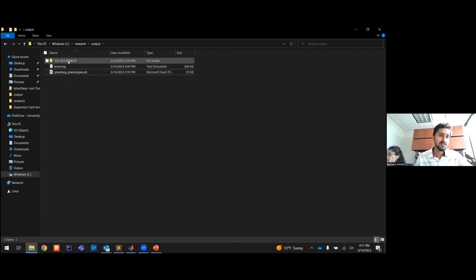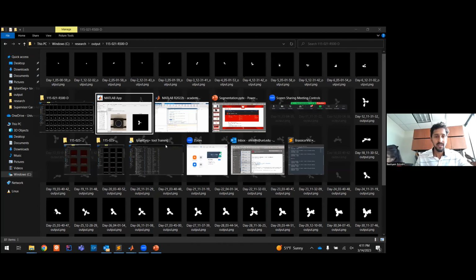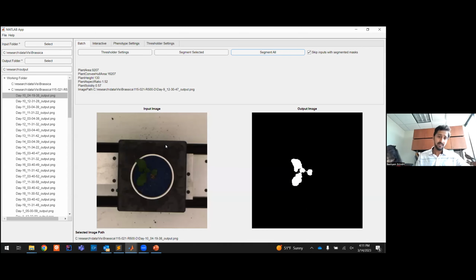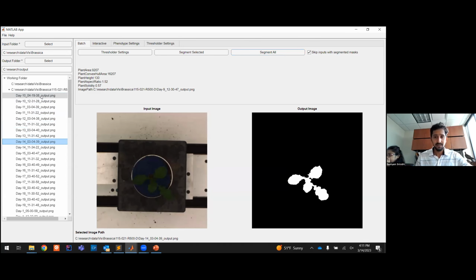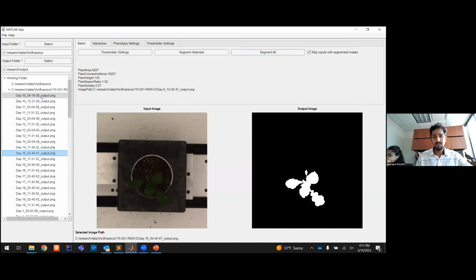So that we need not bother with right now, but we can go back and see how interactive mode can help us. Oh yeah, and also we can verify the results in the app itself by scrolling onto it. If there is an output image available, the output image being the one that got segmented, then it will show it on the right side, just next to the image.